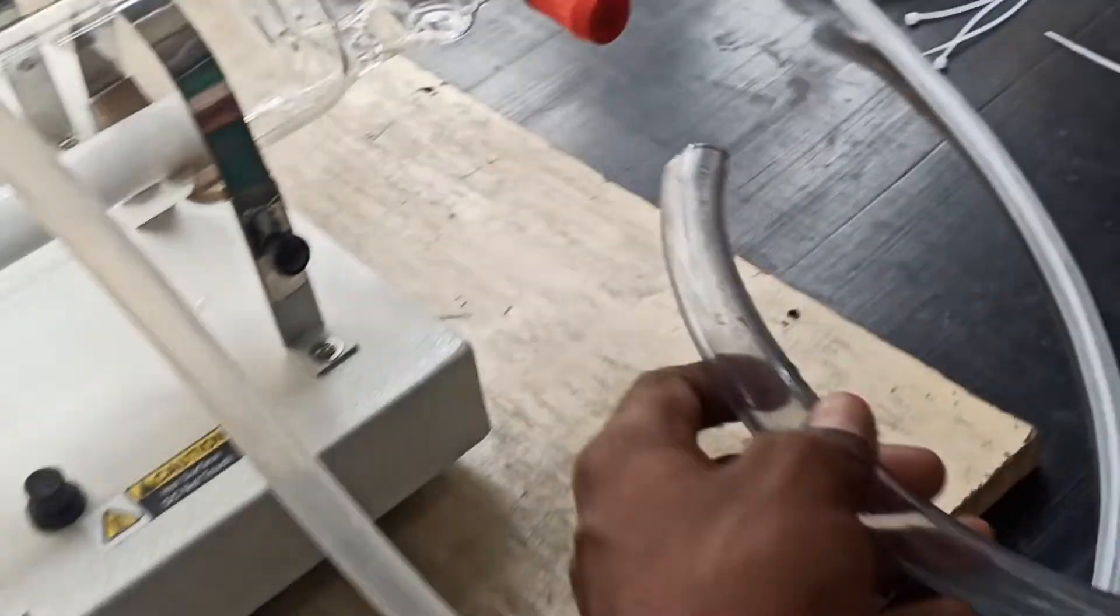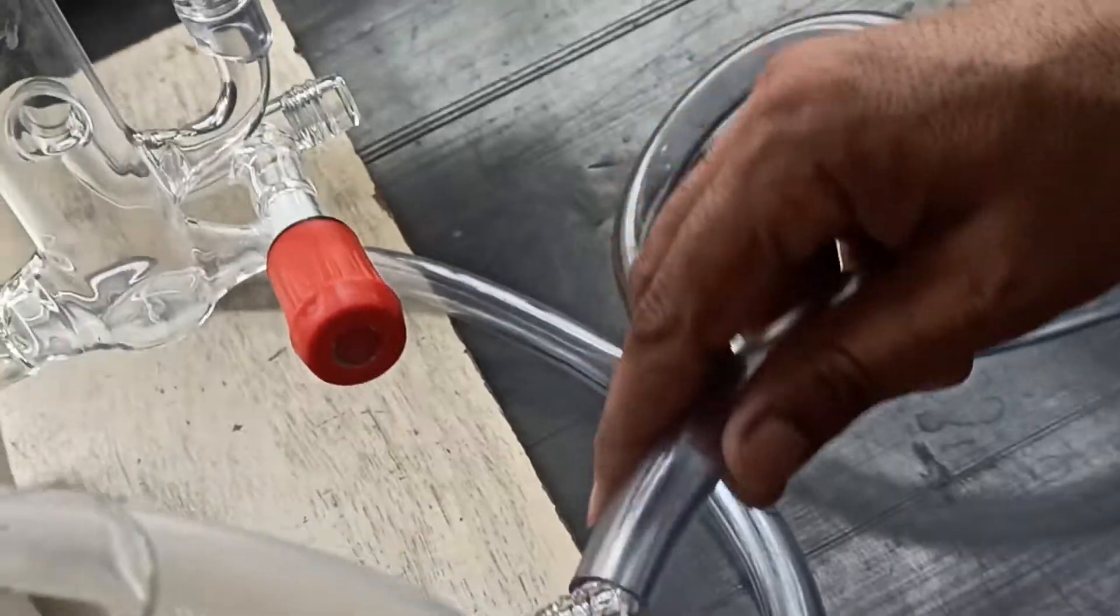Connect PVC pipes to the overflow drain point of both boiling chambers as demonstrated.